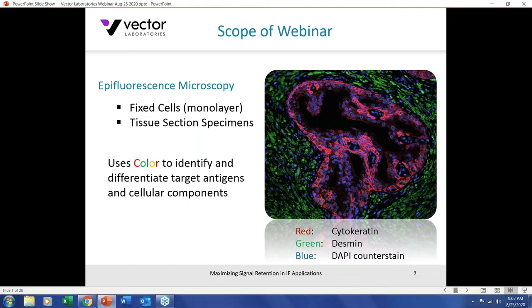For epifluorescence, we're looking at tissue sections cut on a cryostat or vibratome and mounted onto a glass slide, or cells grown on a coverslip or slide as a monolayer, fixed and stained. Epifluorescence utilizes the color of fluorophores to identify and differentiate target antigens and cellular components. I've got an example here showing a double label — cytokeratin in red, desmin in green, and a blue counterstain — leveraging the color of different fluorophores to identify these target antigens.